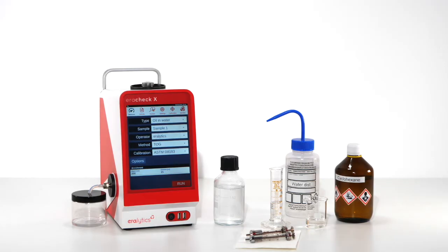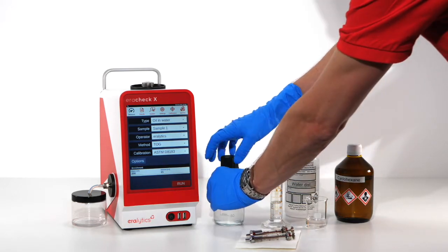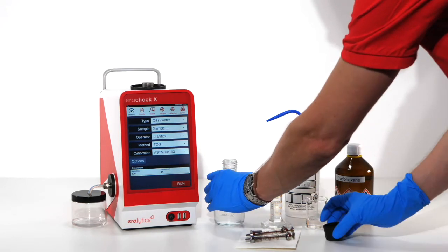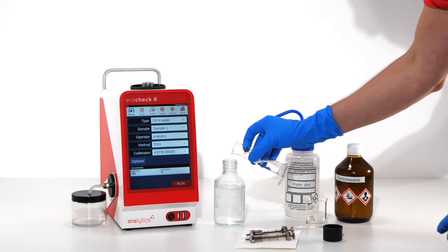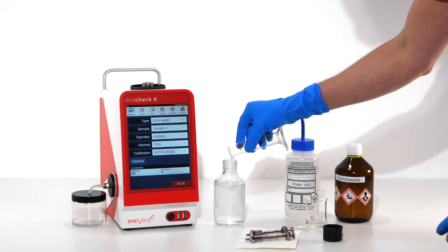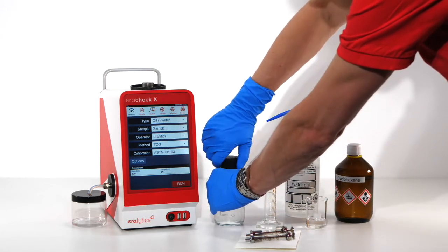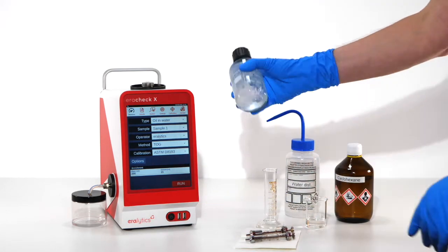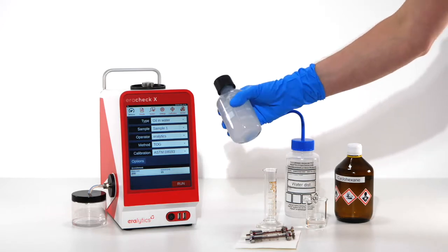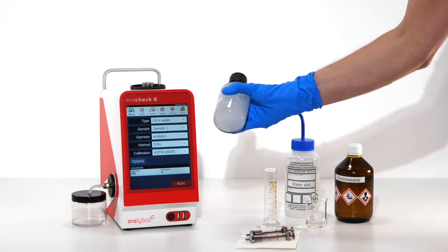Pour 50 ml cyclohexane into the sample bottle containing 200 ml of water sample. Close the bottle and shake it vigorously for one minute. Then wait until the phase separation is completed.